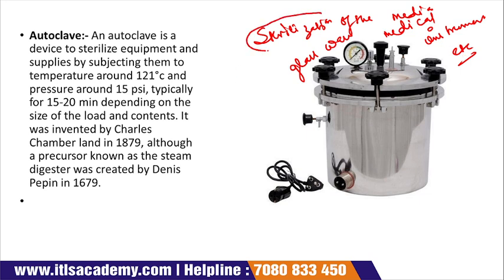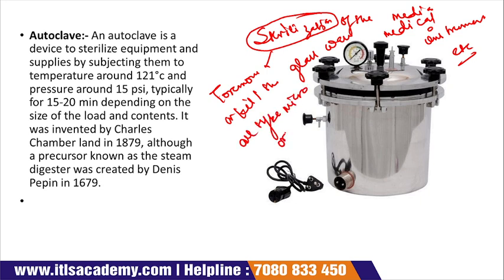Sterilization simply means to remove or kill all types of microorganisms. In the autoclave, we kill all types of microorganisms.